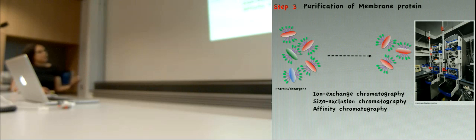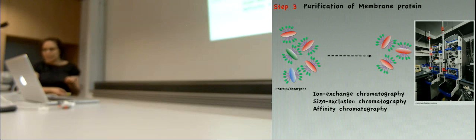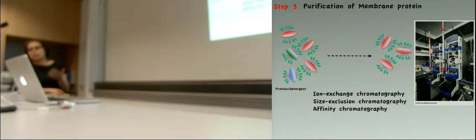After you purify your protein, you can check whether this purified protein is suitable for the later steps. We call it a stability test. You can run an SDS-PAGE gel or a native gel, or simply prepare an EM grid, stain with negative stain, and look under the microscope at how your protein particles look, whether you have some aggregates or your particles are monodispersed or not.